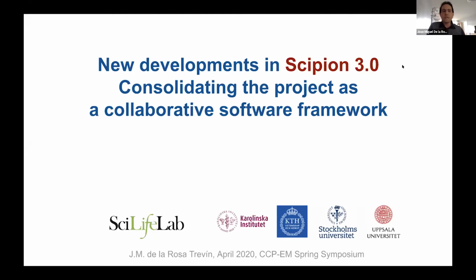So today I would like to present some of the new developments we have been working on for Scipion 3, especially work that we have done in the core to prepare the framework for the future and to become more and more a collaborative software framework.